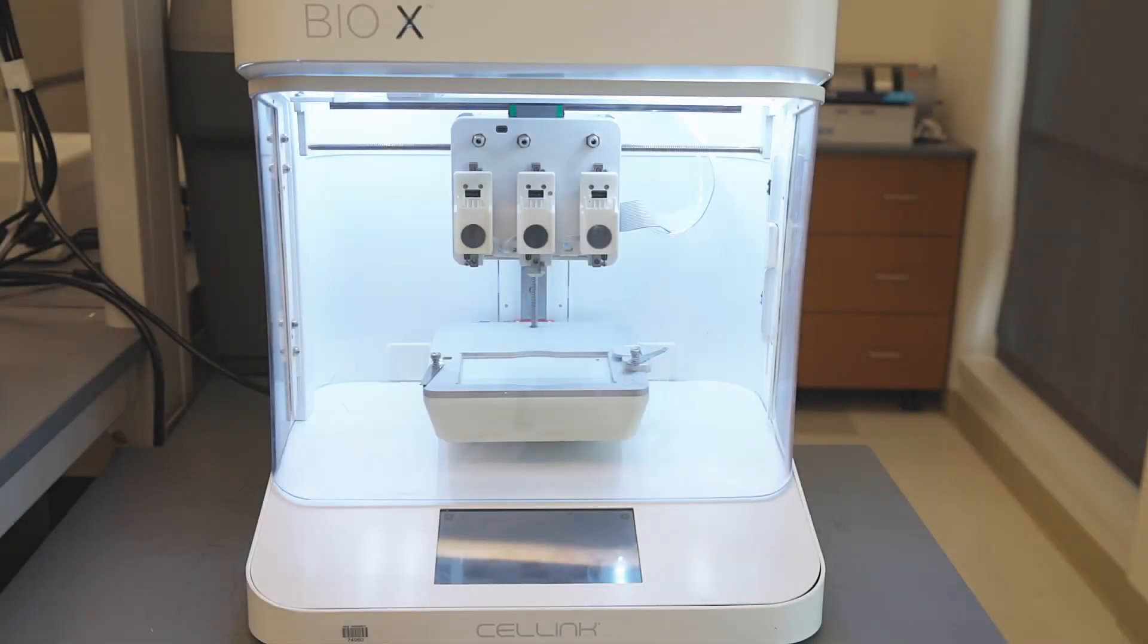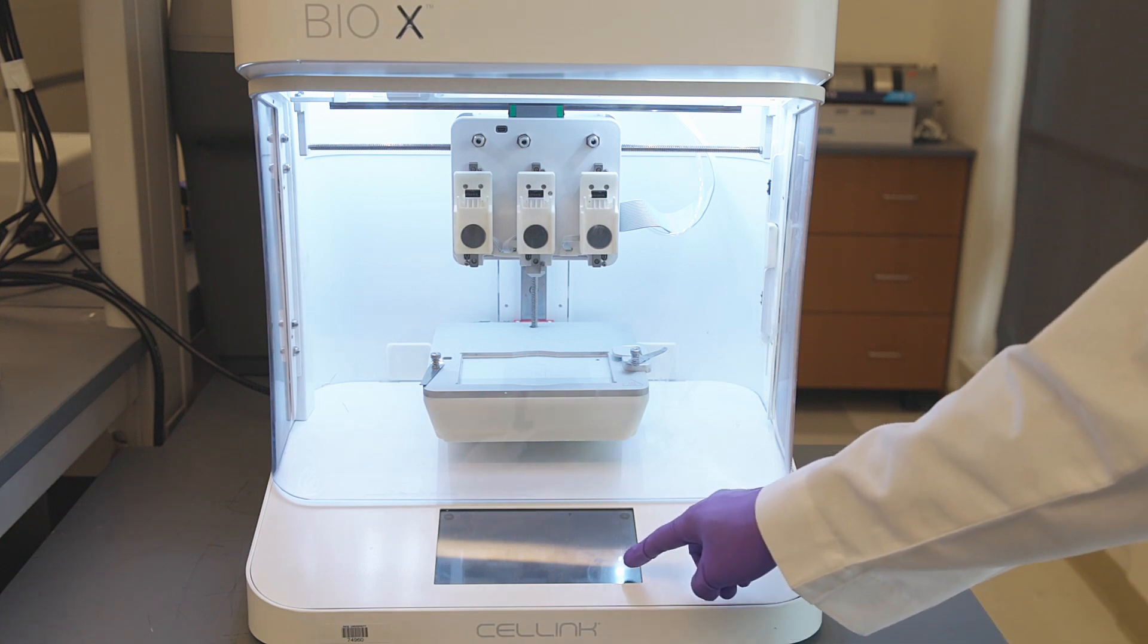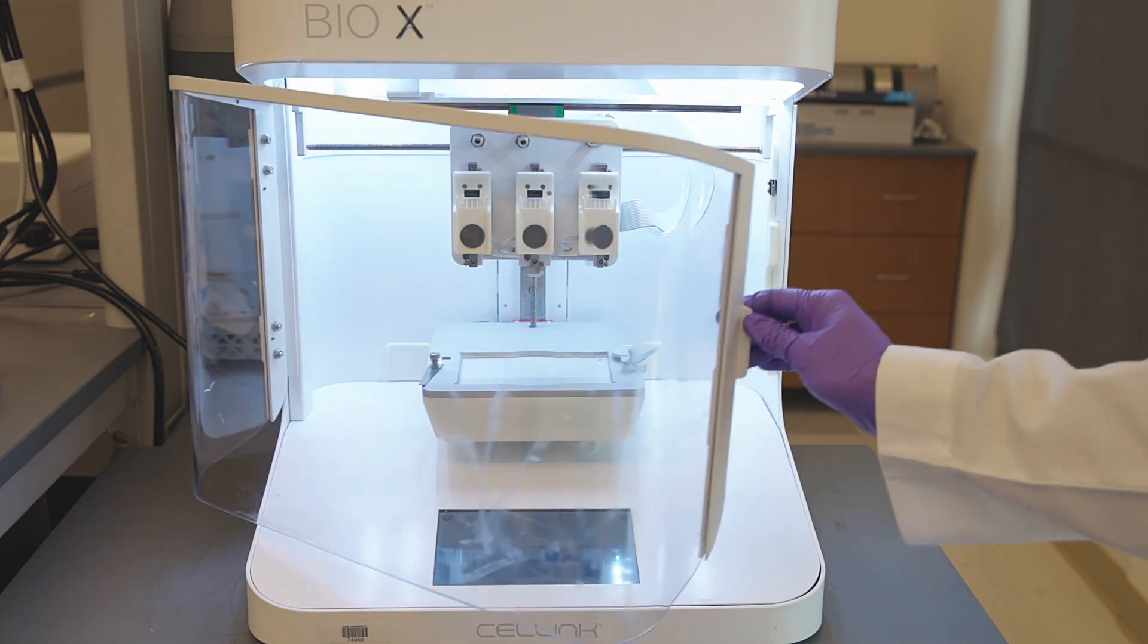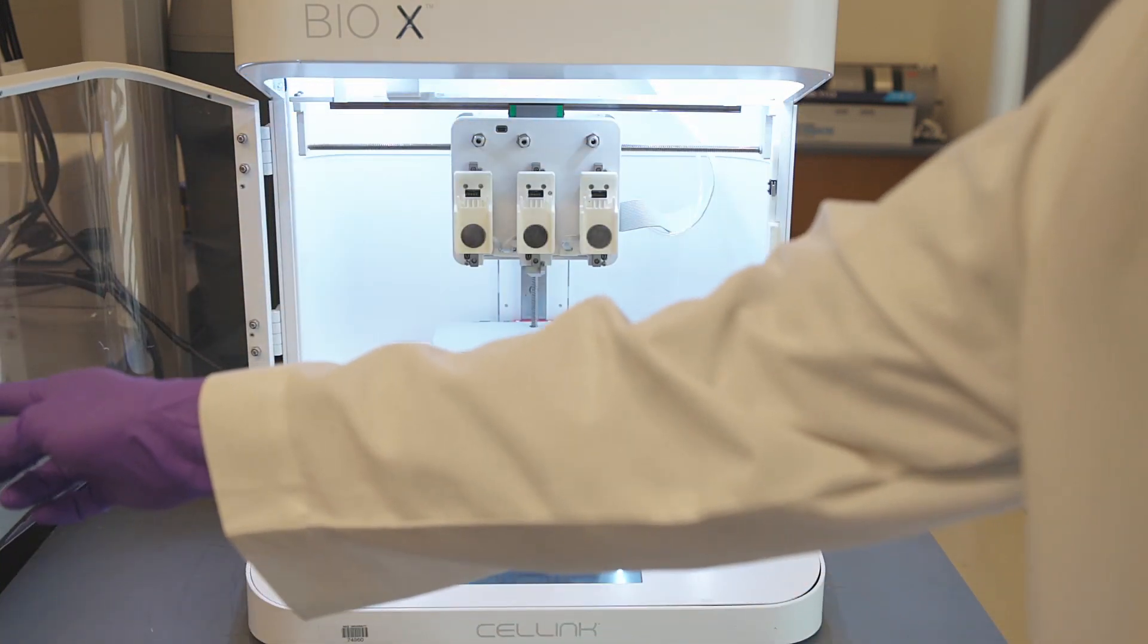The BioX offers an enclosed area for sterile 3D printing. This is the touch interface to communicate with the printer. This is the door to provide a sterile enclosed area.